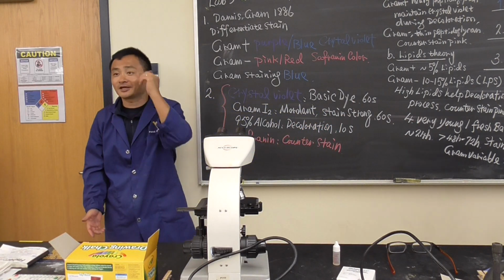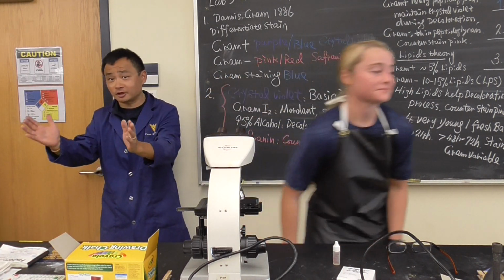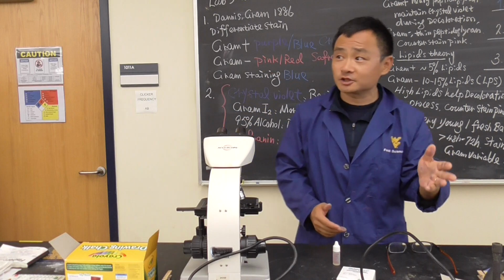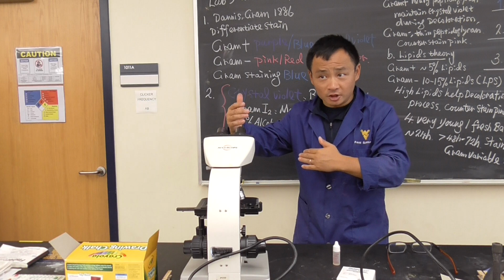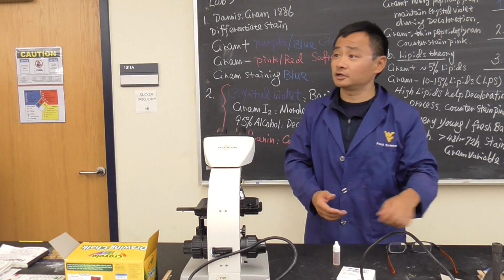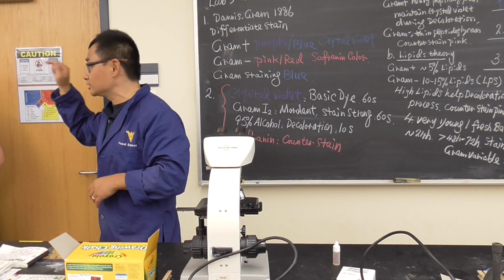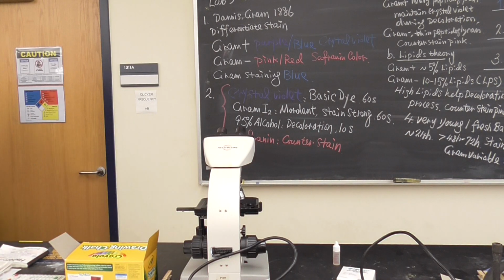Okay, I did it. It looks like Staphylococcus aureus, but I have three pathogens, so maybe I got a cross contamination. So you're going to have to verify it. Ideally, E. coli and the lactobacillus look the same size. E. coli is short, lactobacillus a little bit larger, but one of them is gram-positive and another one is gram-negative. So you decide. Is that okay? I'm already showing you. So come here to get your plates. One lactobacillus, another one is E. coli, then do the gram stain. We'll see what it looks like. Very interesting, the results.